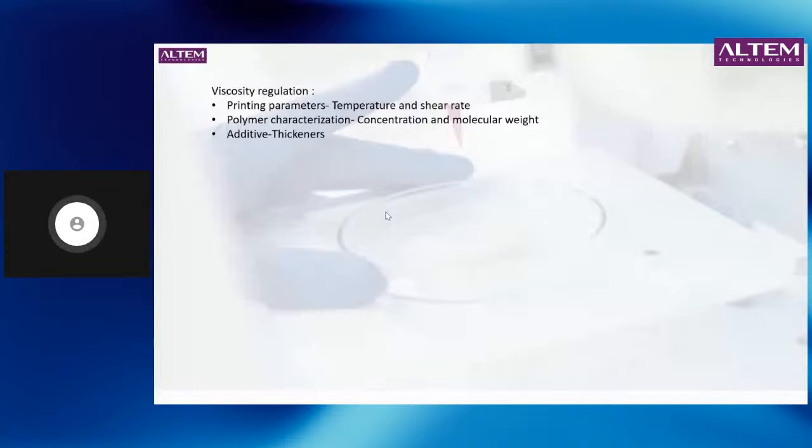So the piston would have some amount of shearing on the material, and also the nozzle which you're using will have a clear impact. So using the right amount of nozzle dimension will play a good role in terms of improving both the fidelity as well as the cell type which is used.